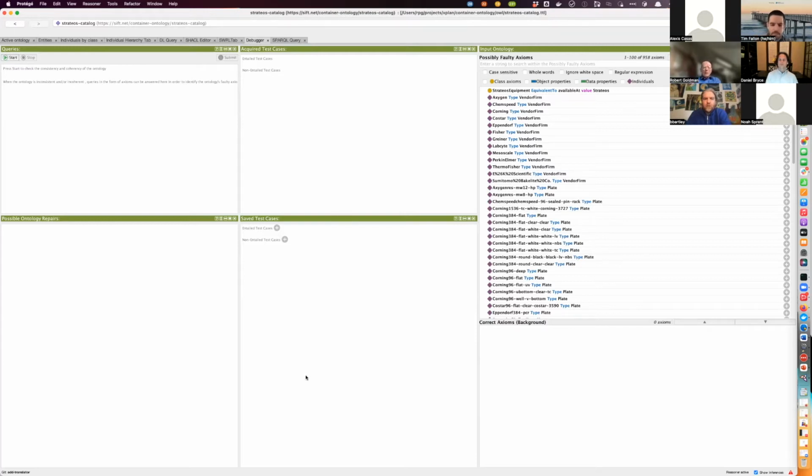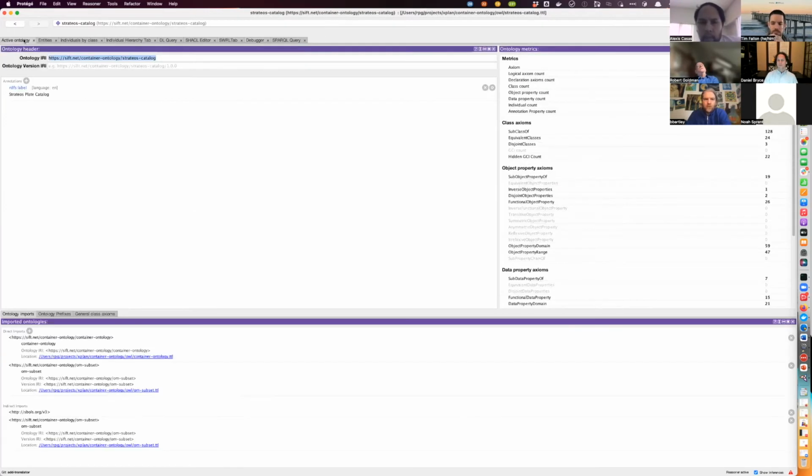Alexei? Yes. Do you think you could show us in one or two minutes, let's say we take one container that comes from a website, a database, OpenTrons or something like that, and how to enter that in Protege?